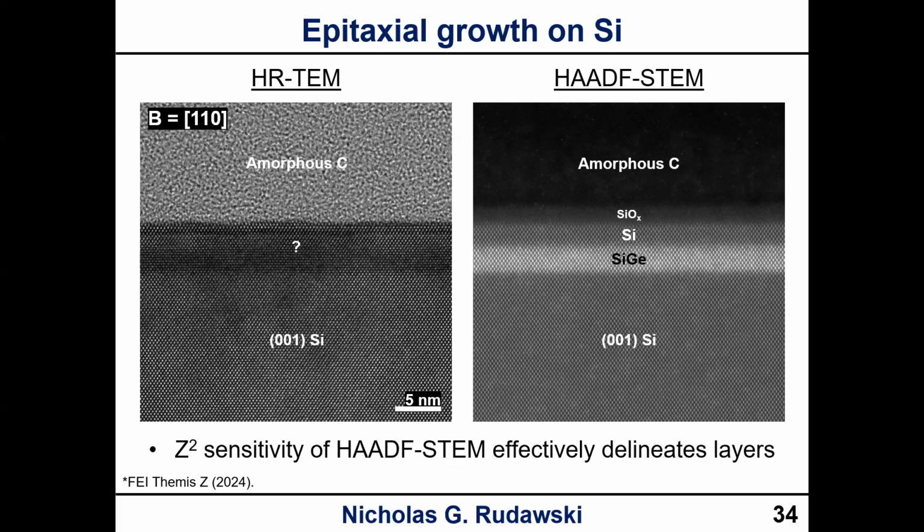Unless there's some kind of ordering to them, there's really no way to isolate one from the other in terms of knowing where I have silicon versus germanium. The way you can do that is if you have some kind of ordering. That usually happens with a specific composition of the material.